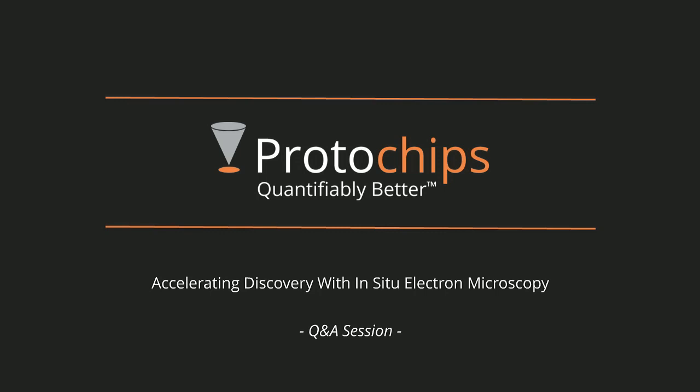Okay, got a couple more questions for Ray now. One of them is, are you aware of any in situ electrical biasing studies of 2D materials at atomic resolution? I'm sure there is. There's some excellent work done at the UK and in Japan, where they're interested in performing biasing studies to look at, for example, in graphene, how you can form 5-7 Stone-Wales type defects simply by putting electrical bias on it. So there is a lot of work out there. You just have to search the literature for that.